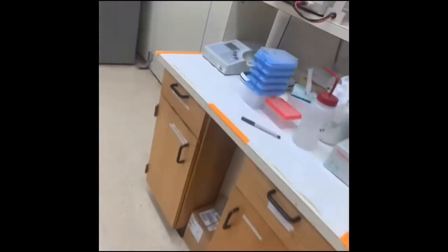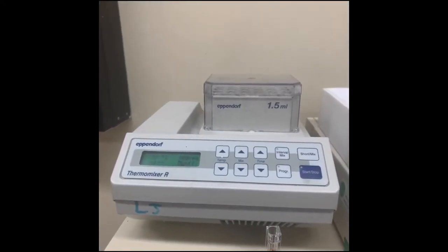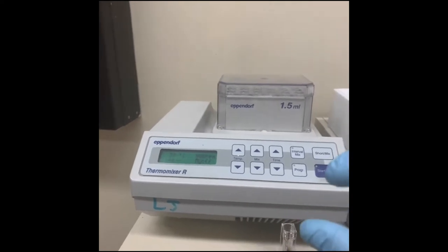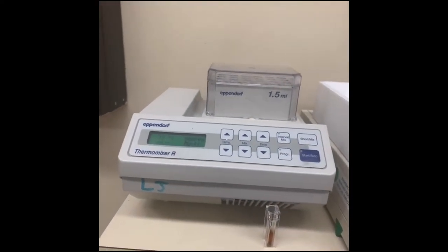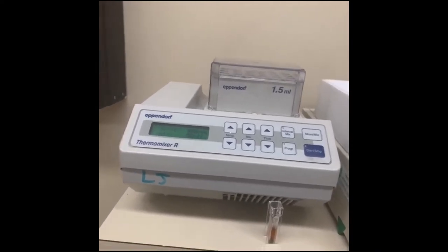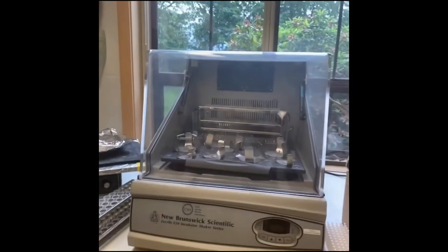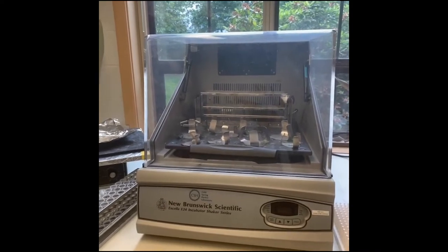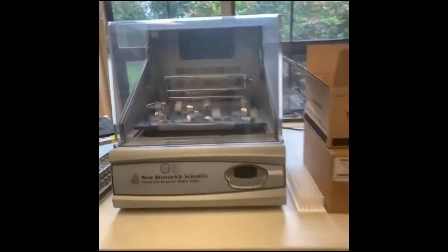We also have shakers for doing cell growth in tubes — like after a transformation when you're letting the cells recover. Then we have a bigger shaker incubator which we use for doing mini preps and smaller cultures. We have larger incubators for other things, and we also have PCR machines which we've talked about before.